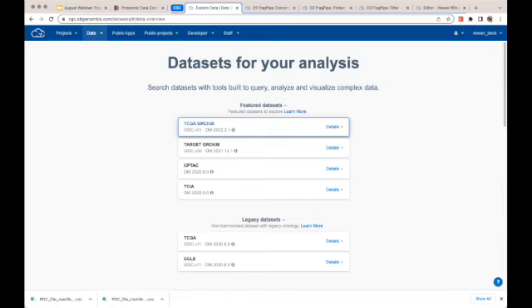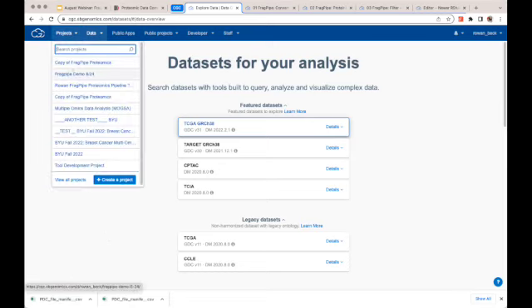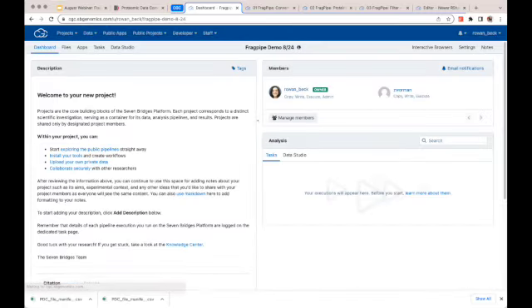If I have my own data to upload in the project, does it have to be CSV? Does the data frame have to be formatted in a particular way? We usually receive Excel files from a proteomics core. No, you can absolutely upload your own data to the platform. Rowan, would you mind going to your account and showing how to upload your own data really quick? We're just going to do an impromptu demo here.